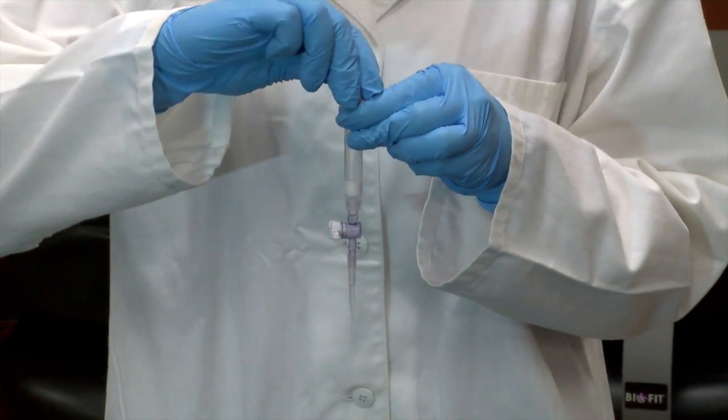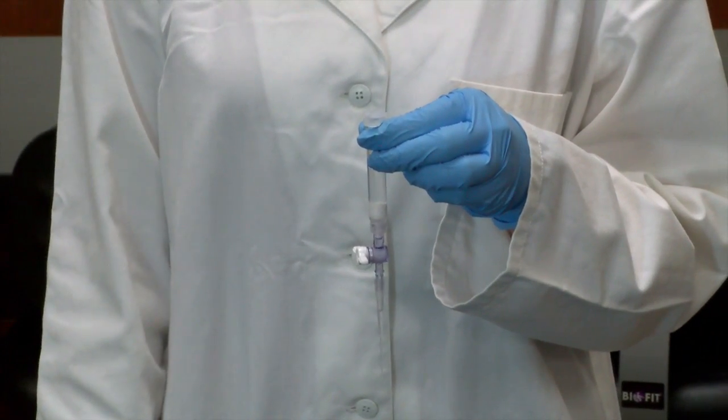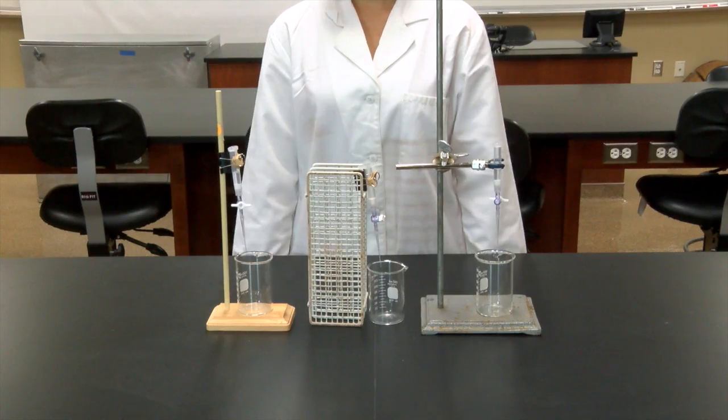To prepare the column, you should remove the bottom end cap and replace it with a pipette tip. You will also need to remove the top end cap.